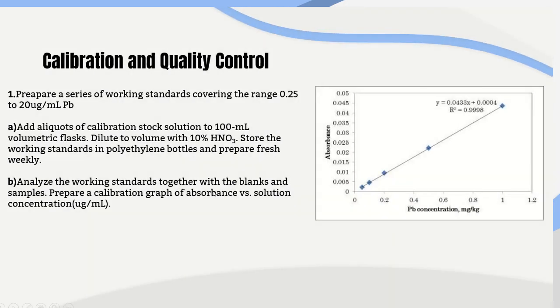And for the calibration part, we need to prepare a series of working standards covering different concentrations of lead, and then we will draw a calibration curve of absorbance versus lead concentration, just like this.